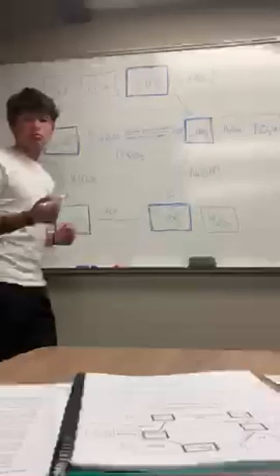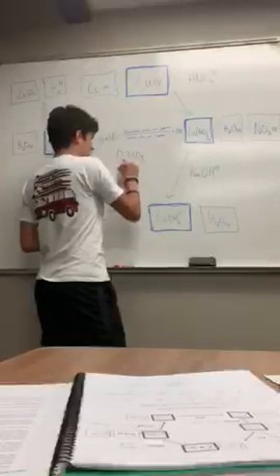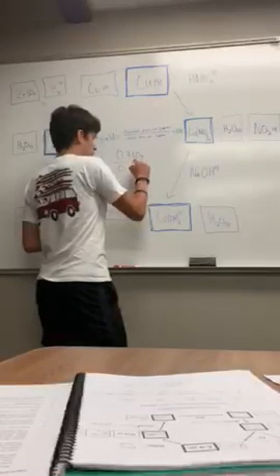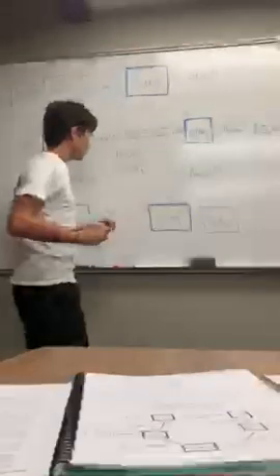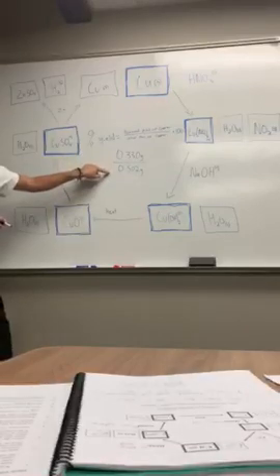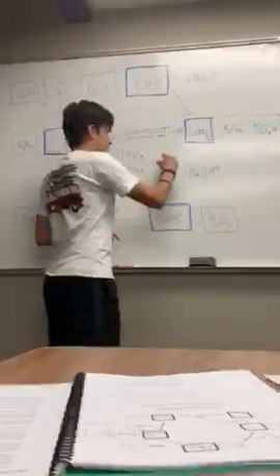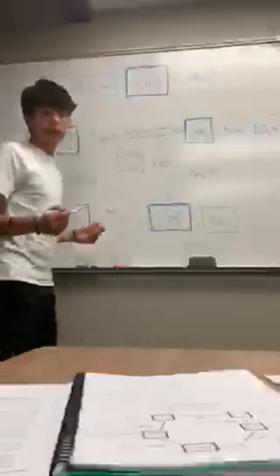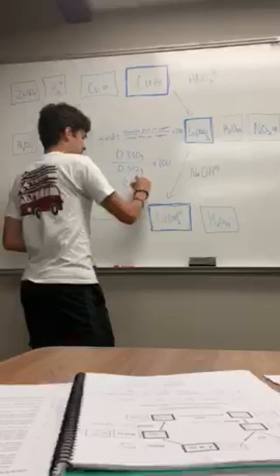And the initial mass of the copper was 0.502 grams. If you were to take this top number and divide it by the bottom number, and then multiply that by 100, you would get 65.7%.